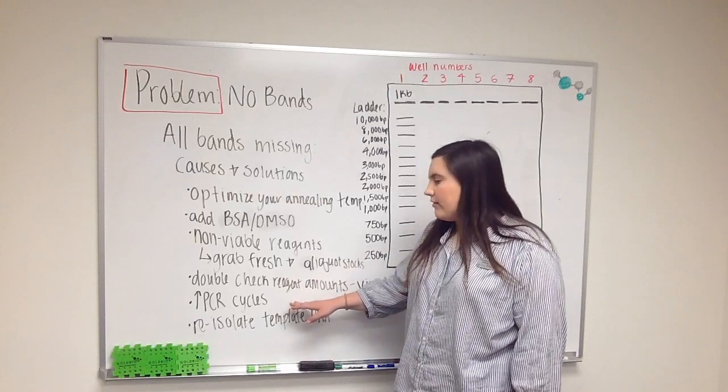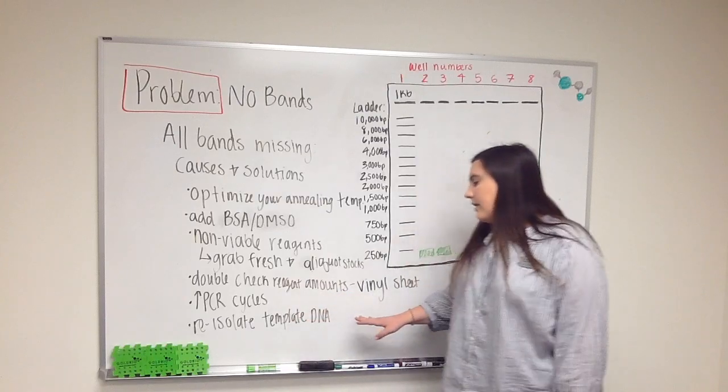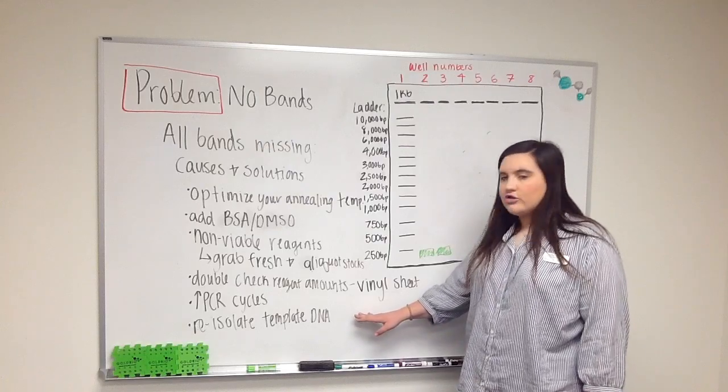You can also increase the amount of PCR cycles and re-isolate your template DNA so that you know you have good quality DNA that you're trying to amplify.